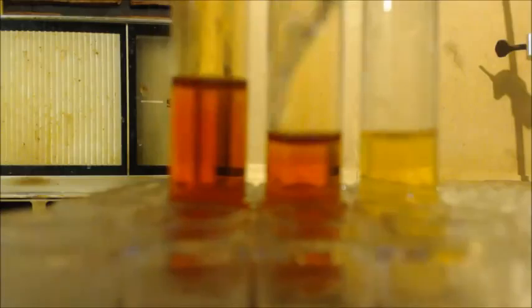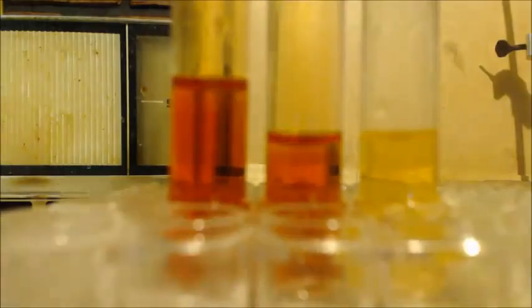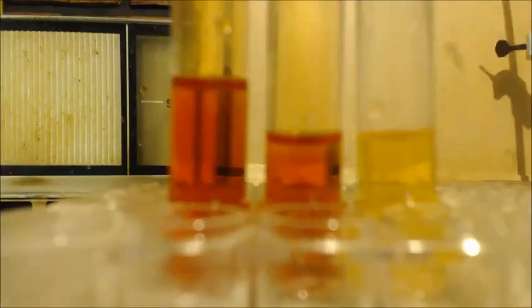And this was my original bromine. I took half of it and put it into here. And when I bubbled stuff through it, it turned orange. But I put too much bromine in there, too much bromine water, you know what I mean? So I took half of it out and I put half in here. And it was orange, and now it turned yellow when we added some more. Now I kept putting more gas in there. I should have figured out my stoichiometry, but I didn't. But you get the gist.